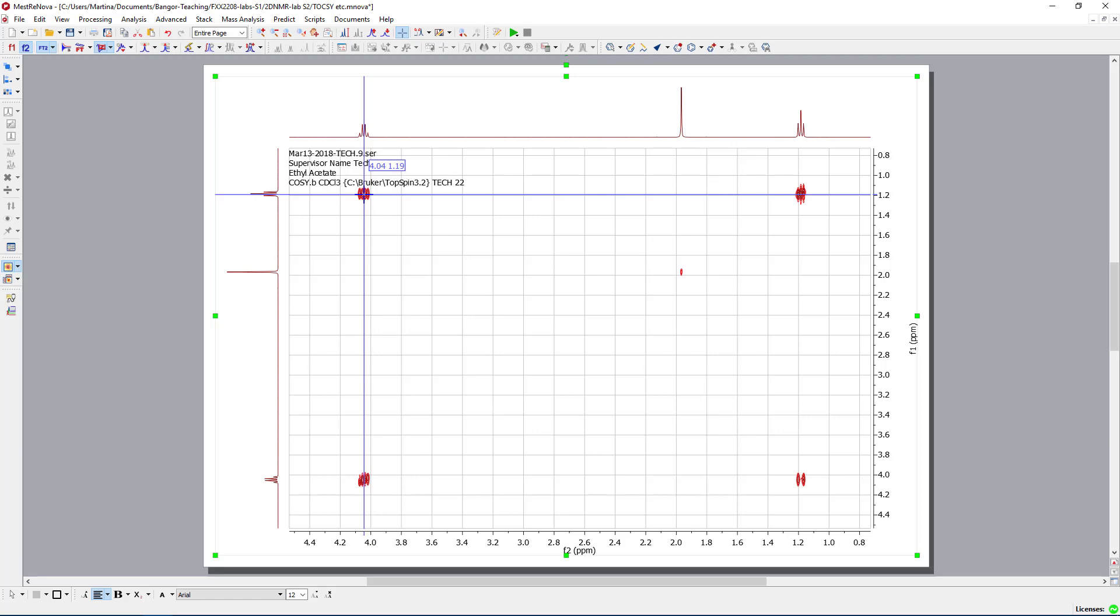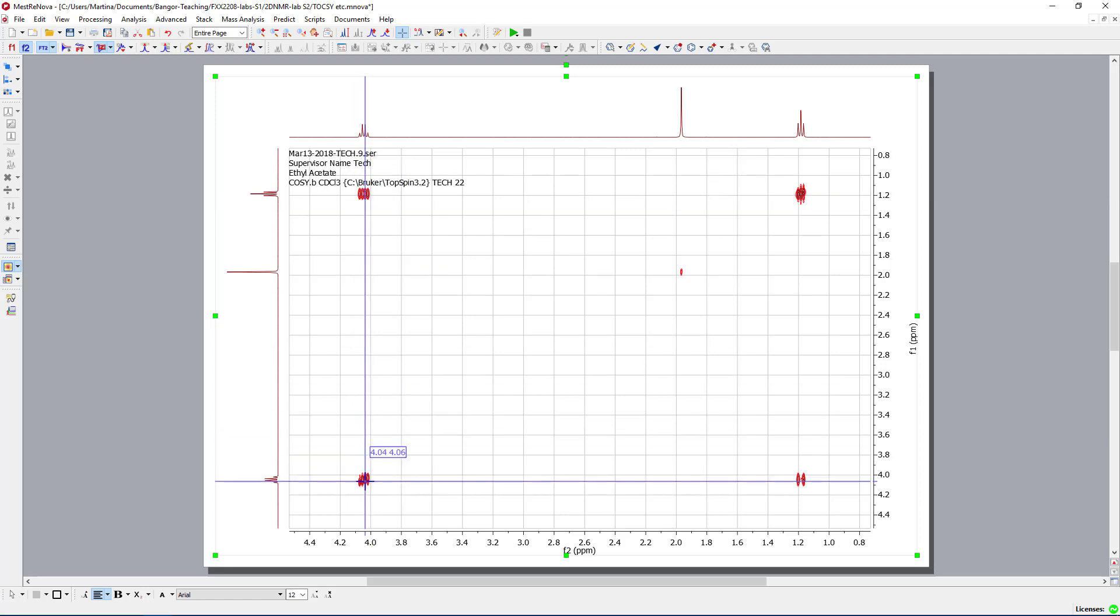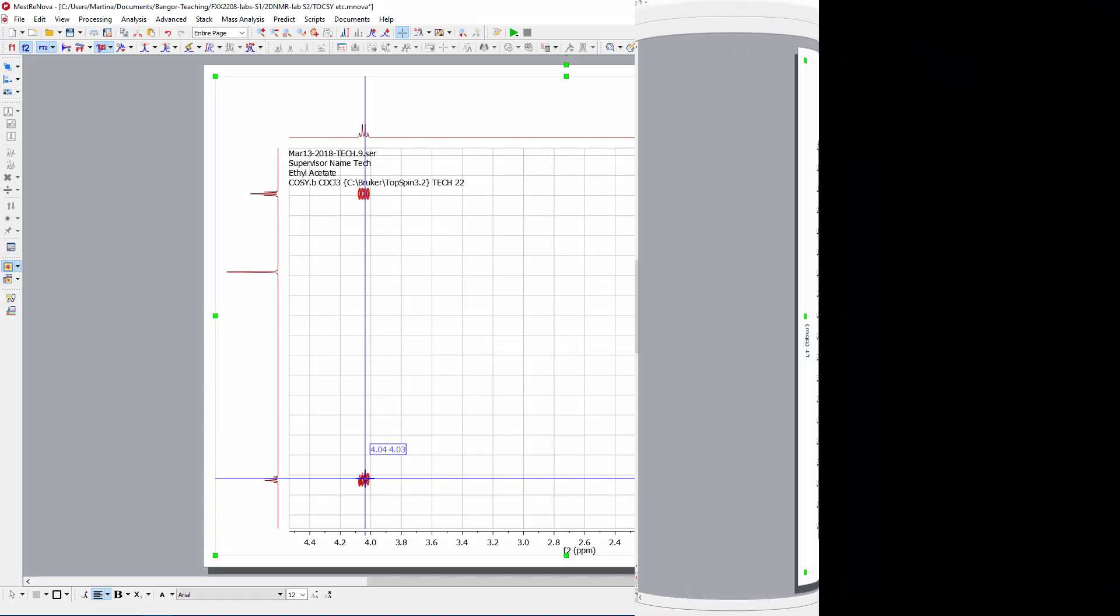So we see the CH3 group around 1.2 is coupling with the CH2 group around 4. And that's all what's visible.